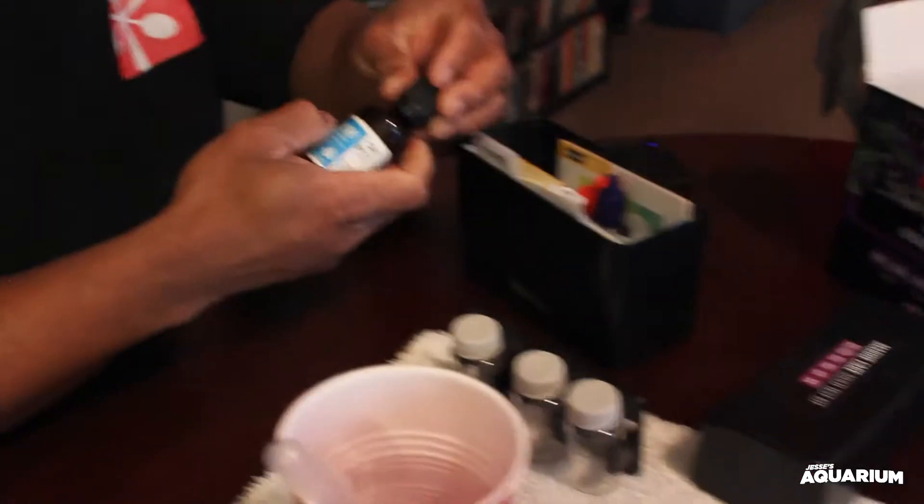Instead of the numbers with the API not really being all that accurate, I would recommend anyone buying this kit. Red Sea, please give us two more vials — we need two more vials so we can complete all the tests at once instead of having to dump out and start over for another test.